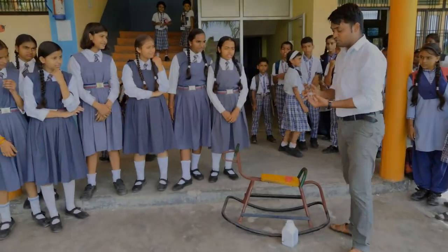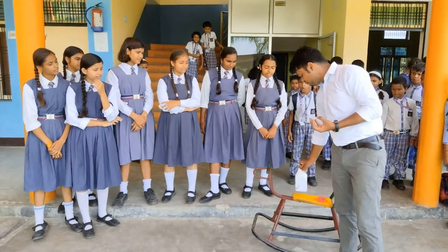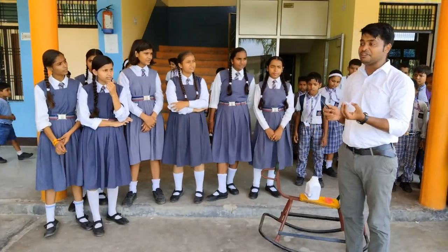This is a sodium metal. Have you ever wondered how sodium reacts with water?